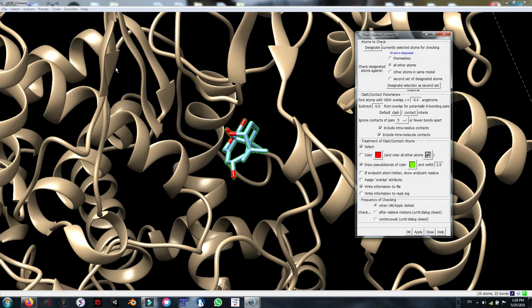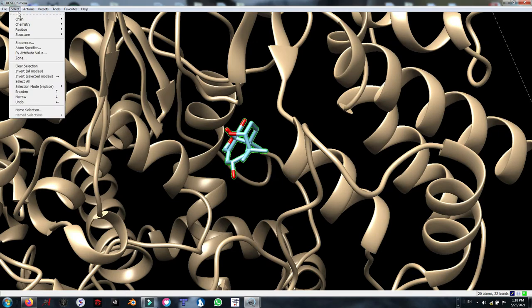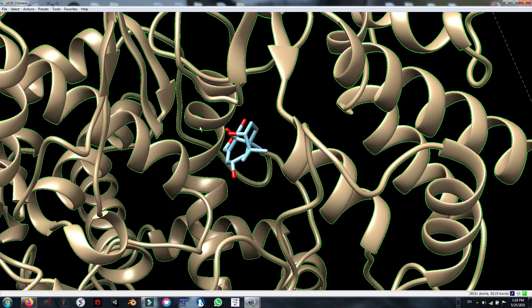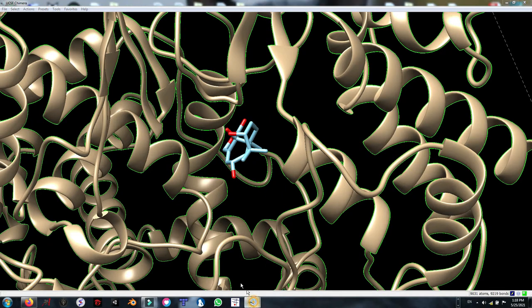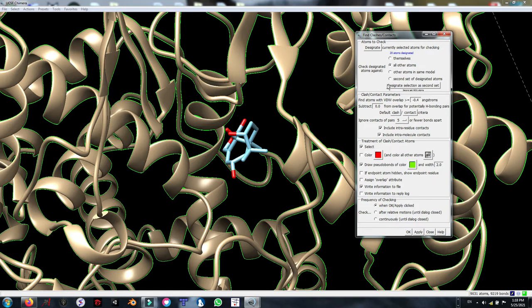Now we are going to invert the selection. By clicking invert selection, I am going to select all other molecules than ligands. As you can see the ligand is deselected. Now I am going to designate my receptor's atoms as a second model. It contains 9031 atoms.